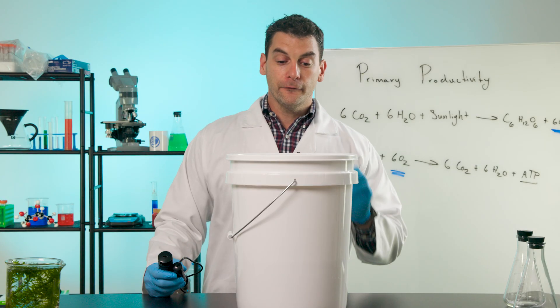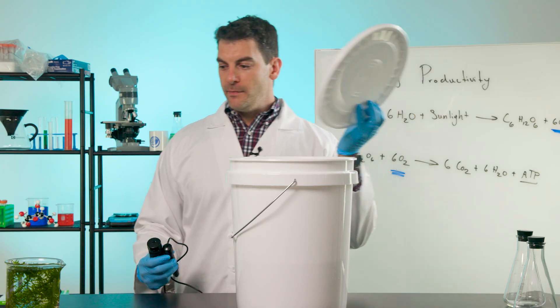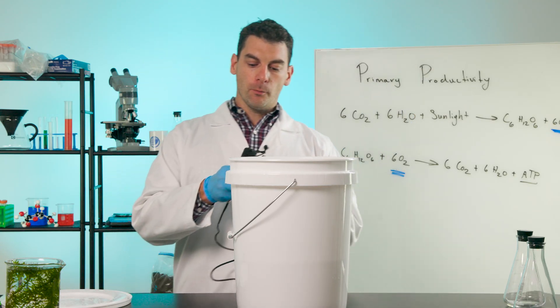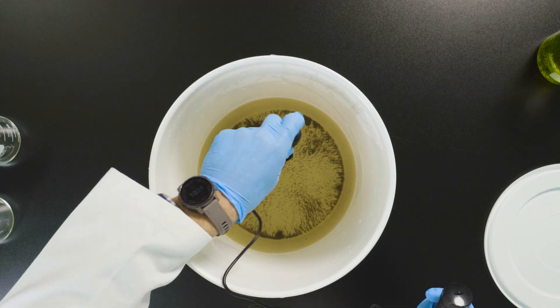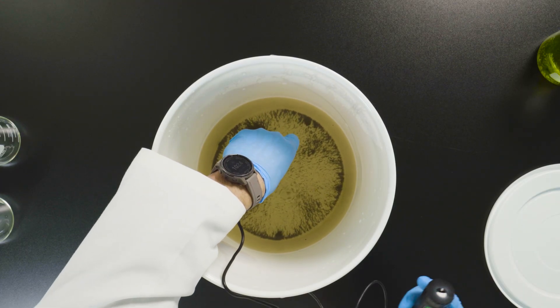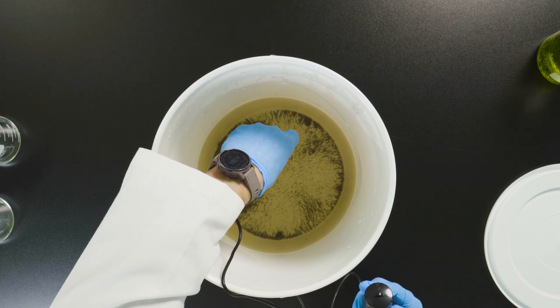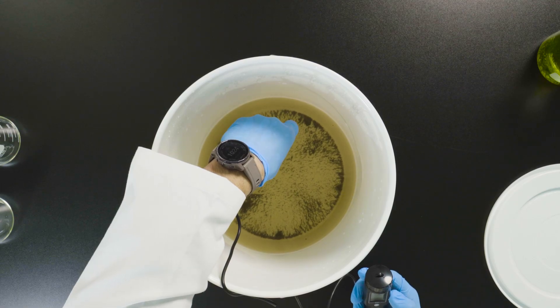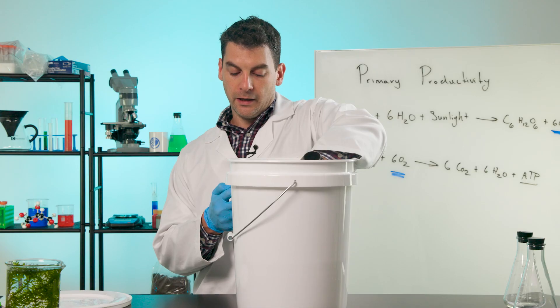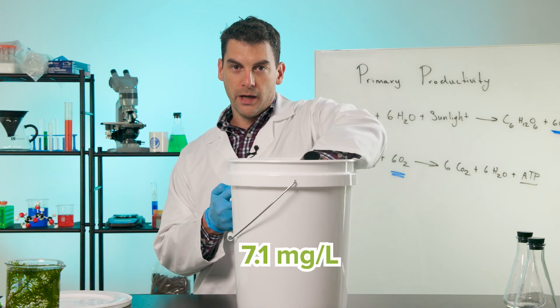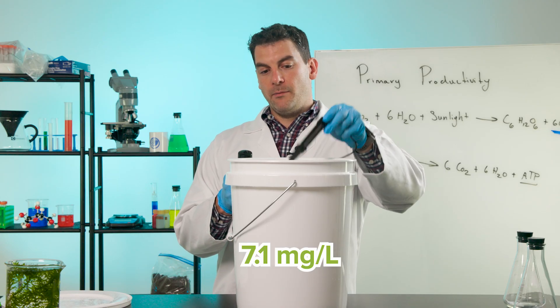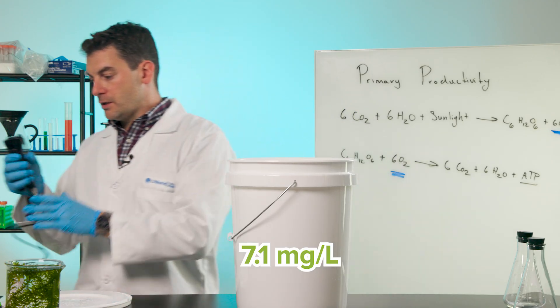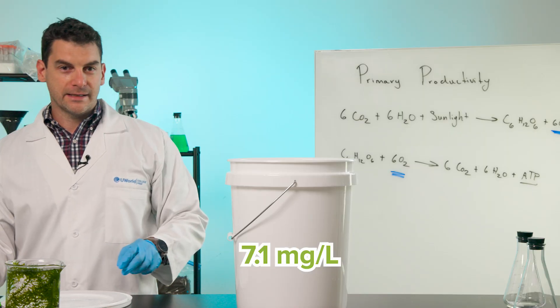The first thing we're going to do is measure the dissolved oxygen of our pond water to establish our baseline. Insert the DO meter into the water and let it even out until you get a nice flat reading. I'm getting a reading of 7.1 mg per liter. So 7.1 is the baseline dissolved oxygen in our water.